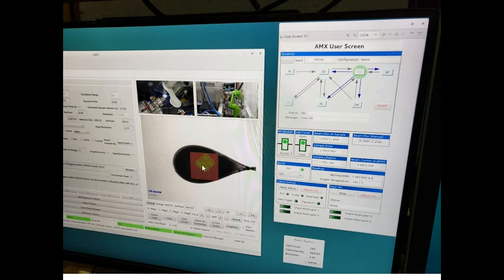Once we've collected all the data, the next step is analyzing it and trying to figure out what our protein looks like. So inside of this little cube, which might be just a salt cube or insulin, inside this cube of protein, there are millions of small little protein structures and protein molecules. And when we hit these with the X-ray, it gives us a diffraction pattern that tells us what the structure looks like. And that is what we ultimately plan to do.